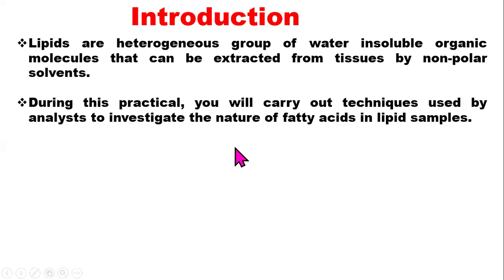During this practical, you will be carrying out techniques that are used by analysts to investigate the nature of free fatty acids that are present in a lipid sample. You know lipids are classified into three categories. We have the simple lipids, which are called neutral lipids, we have the complex lipids, and we have the derived lipids.